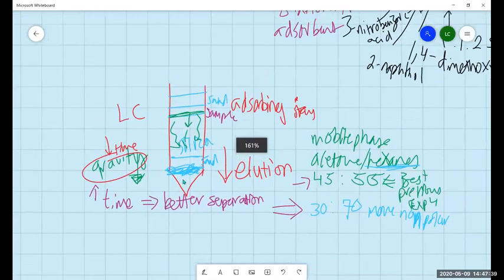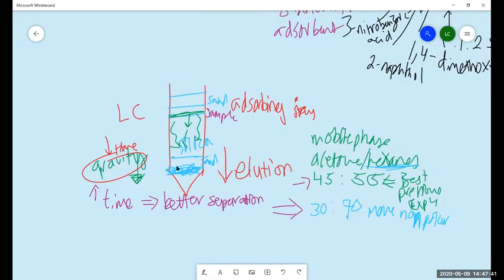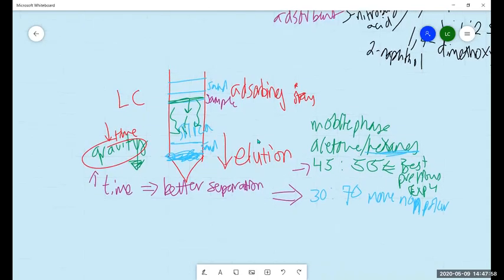And then once you have this, you might have separated. You also pushed it down along the sides of the wall, so it gently pushes down. You don't want turbulent, or just fast flow. You want it to be slow and easy, nothing accelerating.